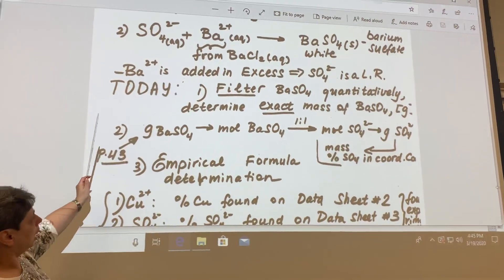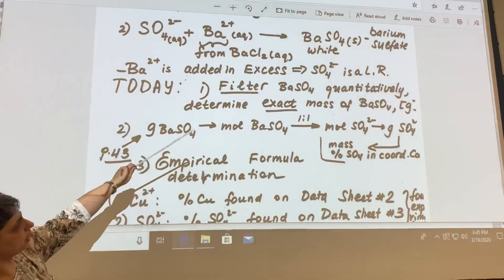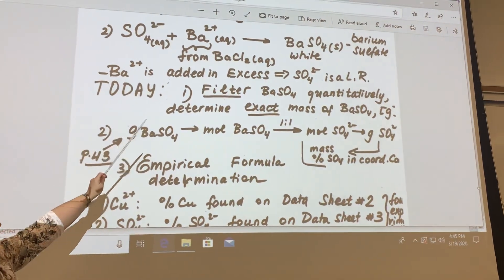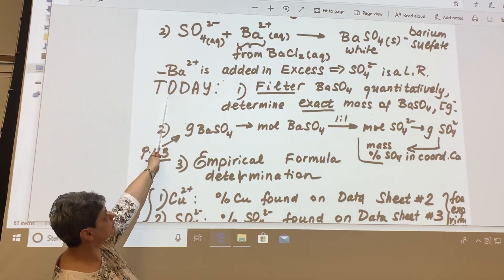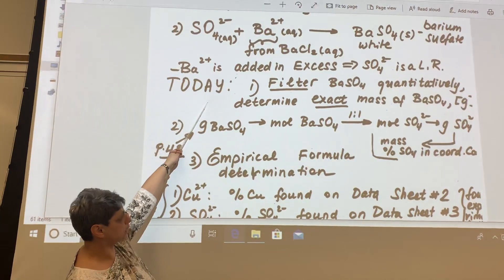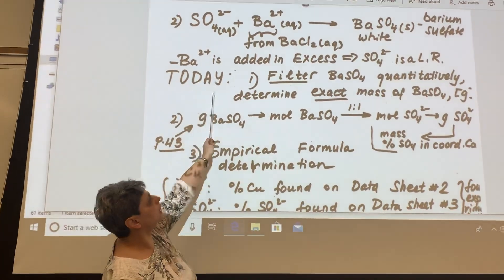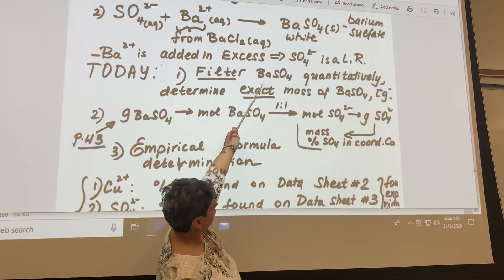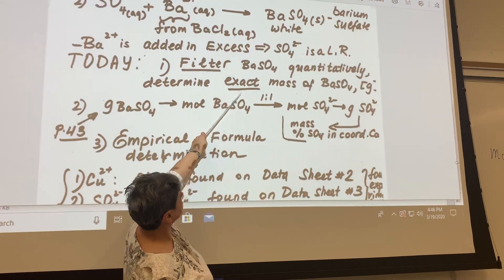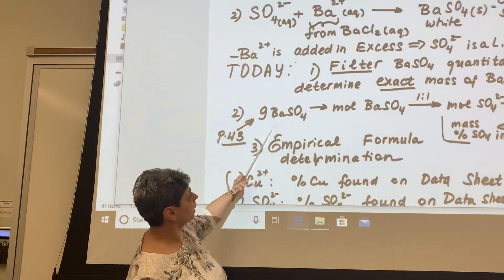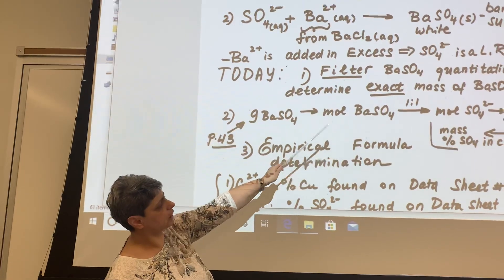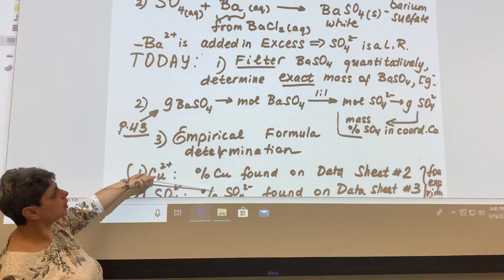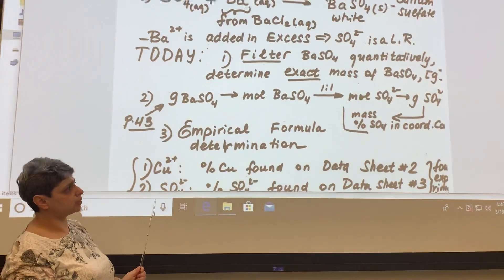Today's procedure will include dissolution of the substance and precipitation of barium sulfate. Then next week's lab we would filter barium sulfate using gravity filtration — to be as accurate as we can, collecting every possible particle of the solid — so we can figure out the exact mass of barium sulfate and then use that mass to calculate moles of barium sulfate, then moles of sulfate, then grams of sulfate. I will discuss all of this in next week's video, so today we are just going to go ahead and start with our experimental procedure.